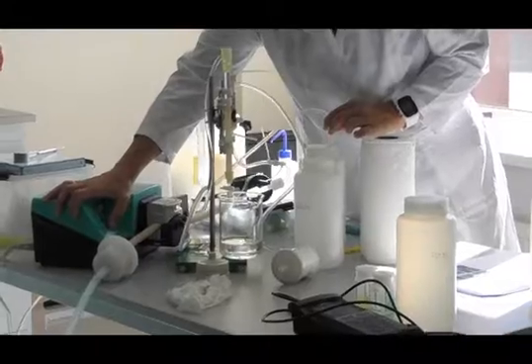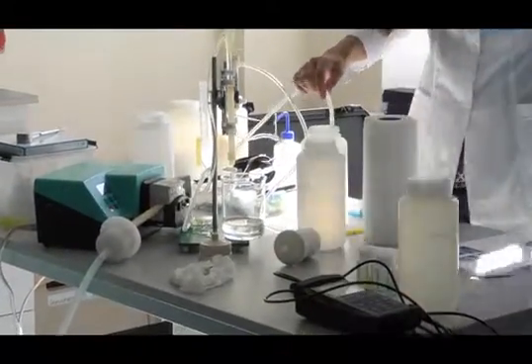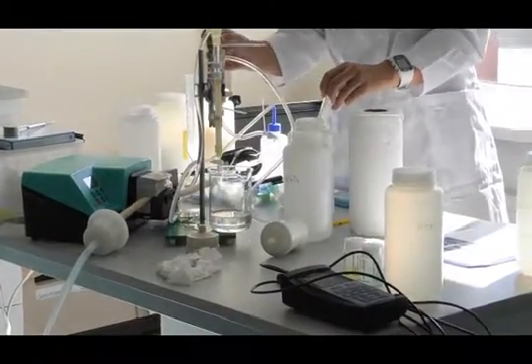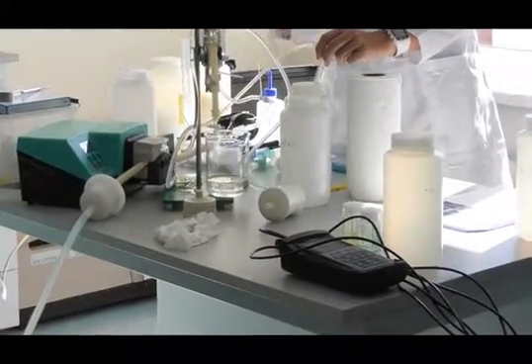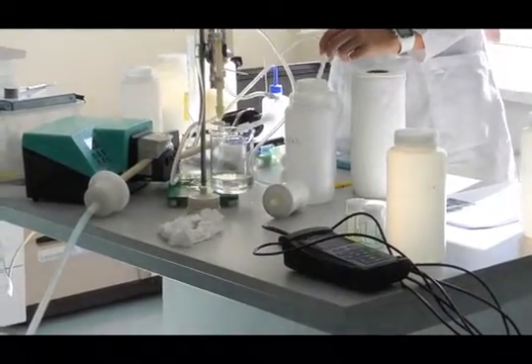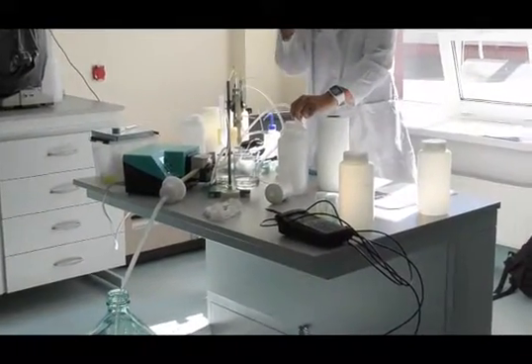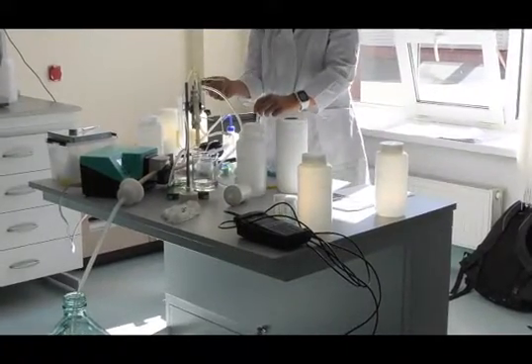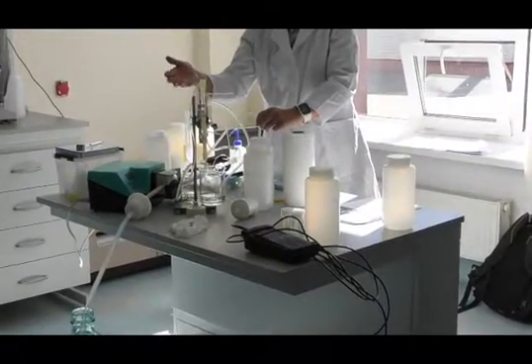So you don't need to do that for the whole sample. So you use two filters? One. Yes, but as I said, this sample is just going through this one. It's just to avoid connecting and disconnecting it. It doesn't collect anything, it's just going through these tubes. Nothing happens. So it can be put on even when you sample the other fraction.